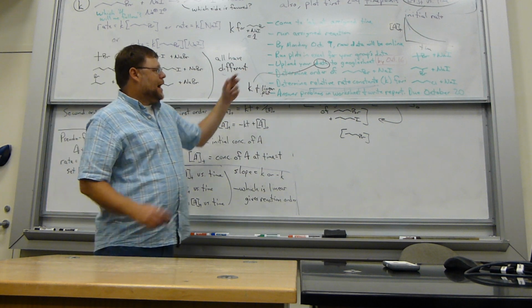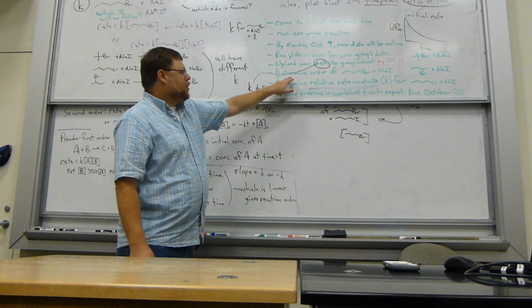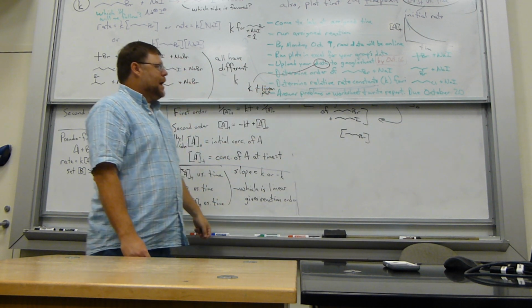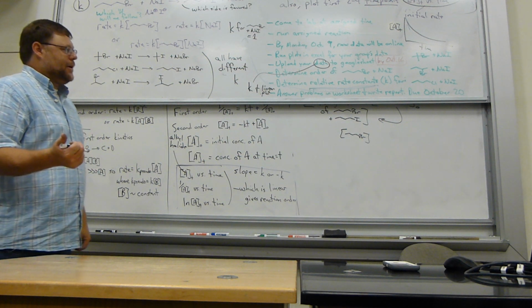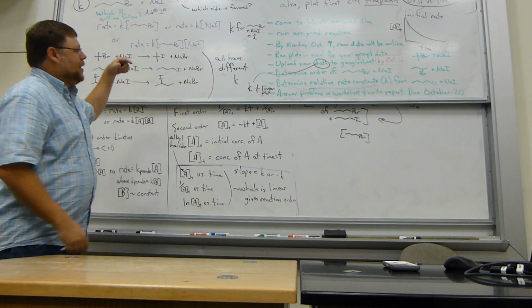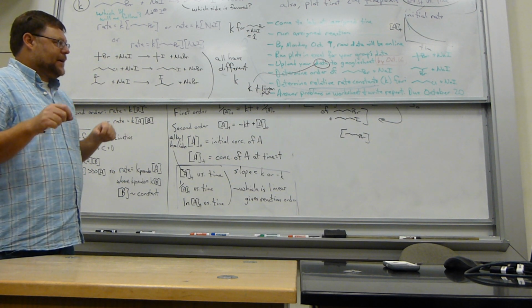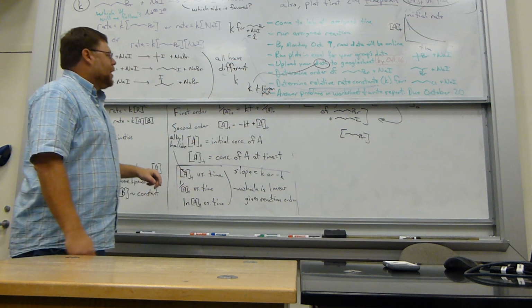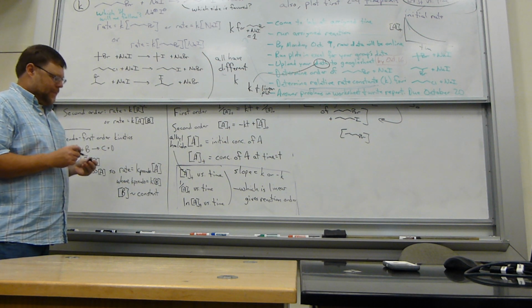And then, after everybody's data is online on October 16th, you're going to use that data. You're going to use everybody's data to determine the reaction rate order of n-butyl bromide plus sodium iodide. So that's the reaction rate plots, looking at various concentrations, how changing the concentration of reagents affects the reaction rate. And then you're going to determine the relative rate constant for these other three reactions. Are they faster or slower?